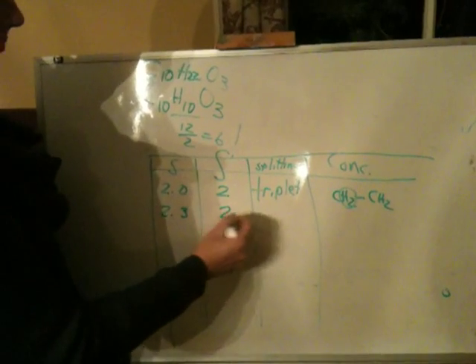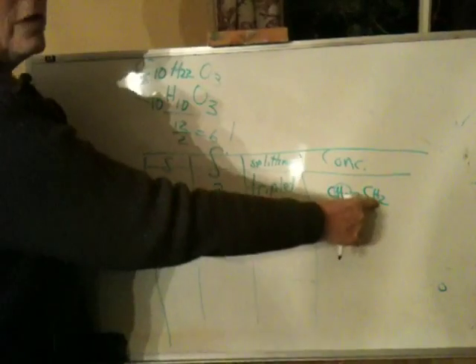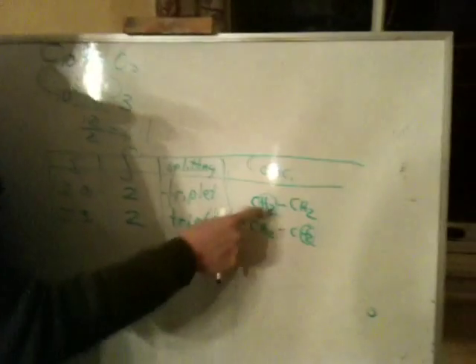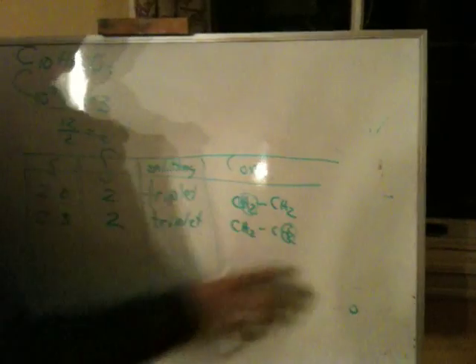Area of 2, again, it's a triplet. Now what you're seeing here is really just the other CH2. So once again, I'm seeing a CH2 next to a CH2, but I'm actually going to identify that as this one. So we're seeing this talking to this, and then we're seeing this talking back to that. So that's perfectly consistent. There's nothing too extraordinary there.